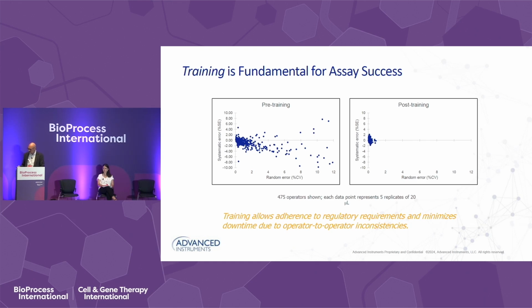And what we're talking about is if you have analysts who are pipetting like this over here, and you try and move that extraction or sample prep step into an automated system, you're not going to get accurate results, or most of the time you're probably going to get failed results. So it's important to understand that not only is optimizing your liquid handler important, it's also important that your analysts have the capability to pipette accurately and precisely when moving it into your automated system.